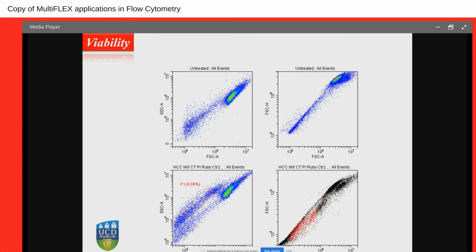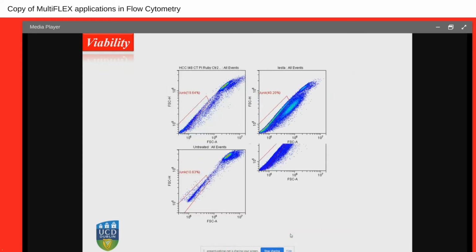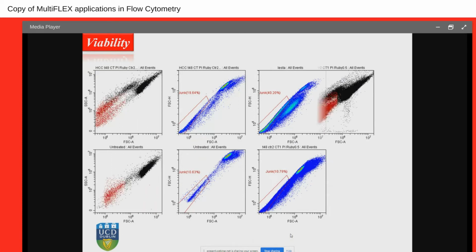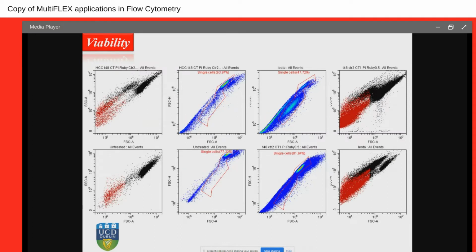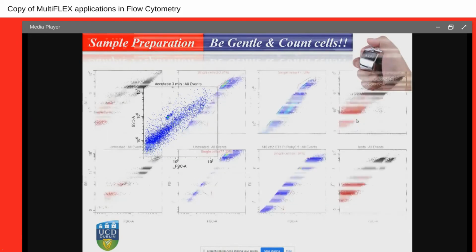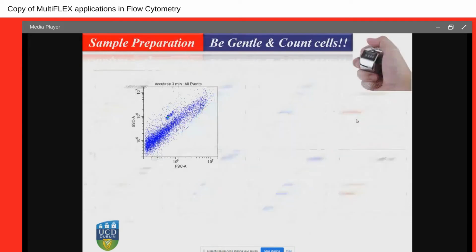We can see here more dead cells, but they are already moving into the junk. So they're moving from here to there. And these are completely junk fragments already. So if this is the junk, as we can see there, these other ones that are now in black are the remaining. And you can see this is where we have our cells. So that's why I like to use that kind of gating to look at my cells. If I'm trying to analyze alive and dead, that's the way I will select them, or just basically remove my dead cells from the analysis.